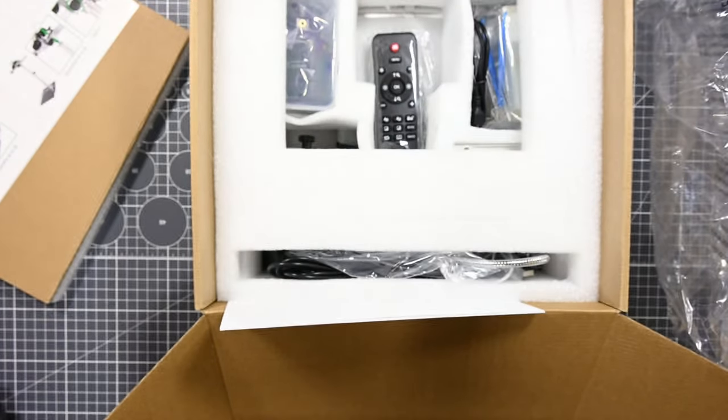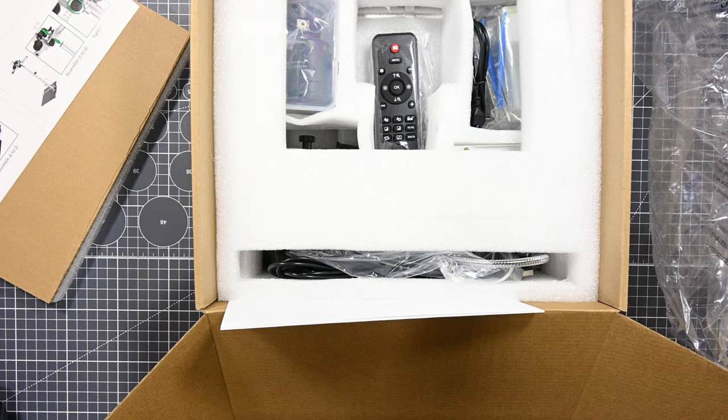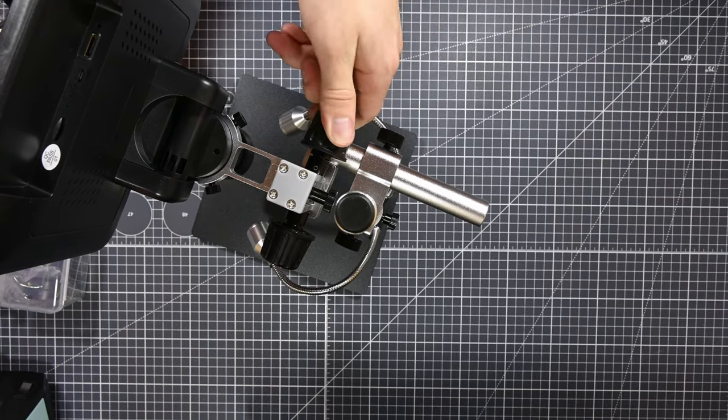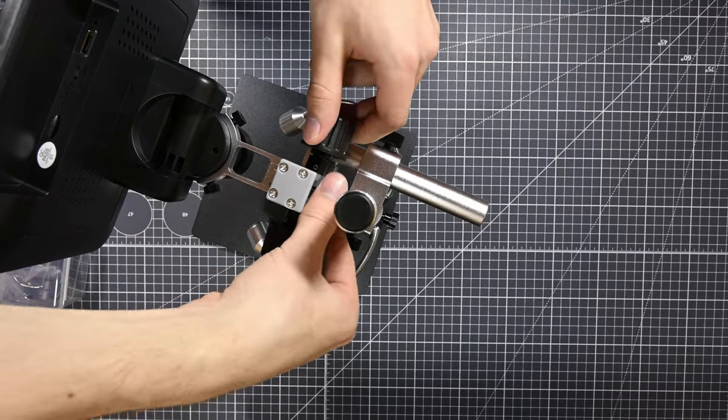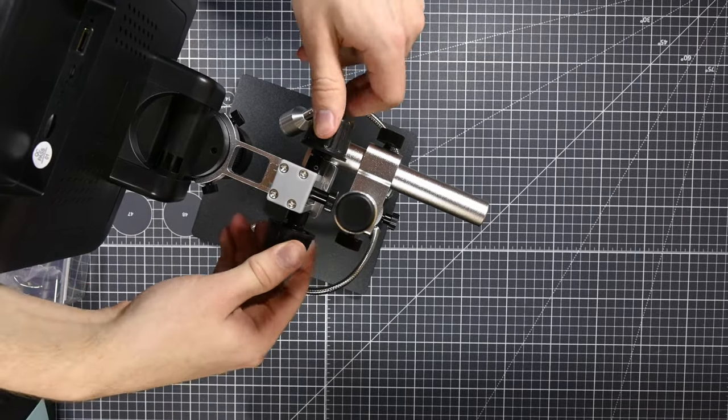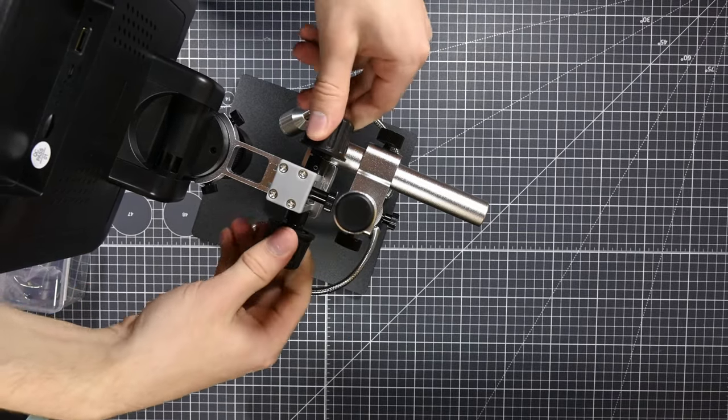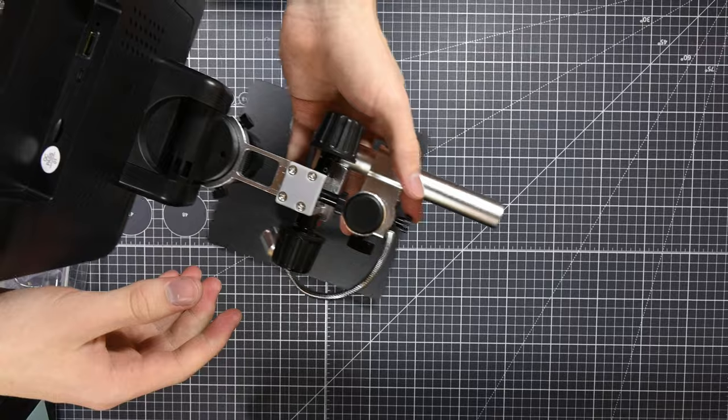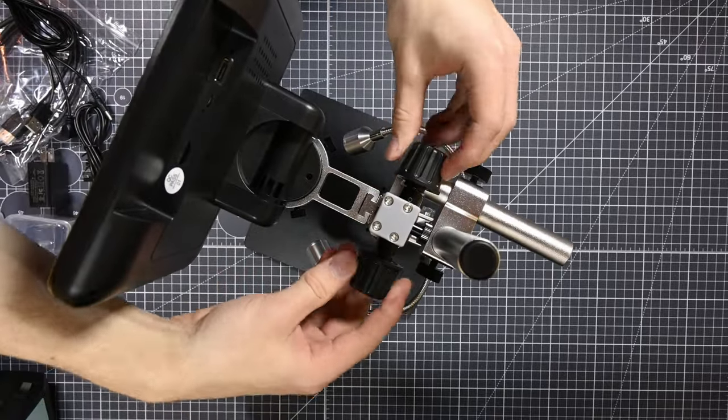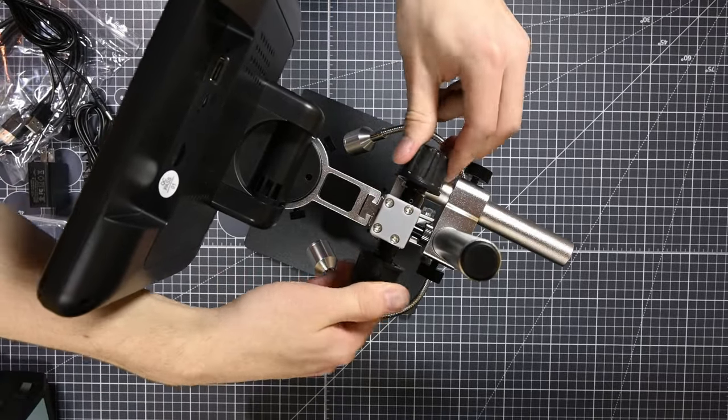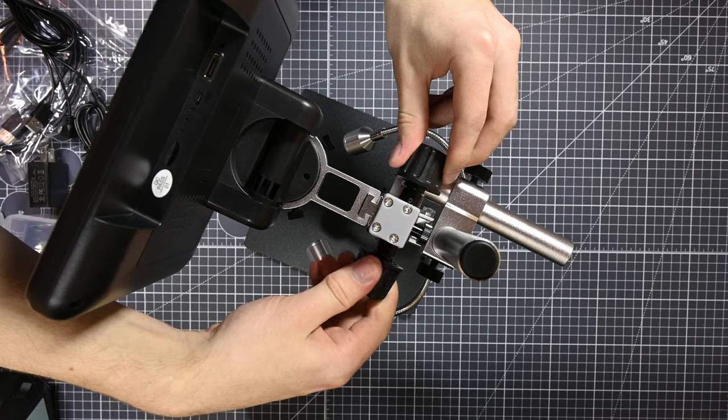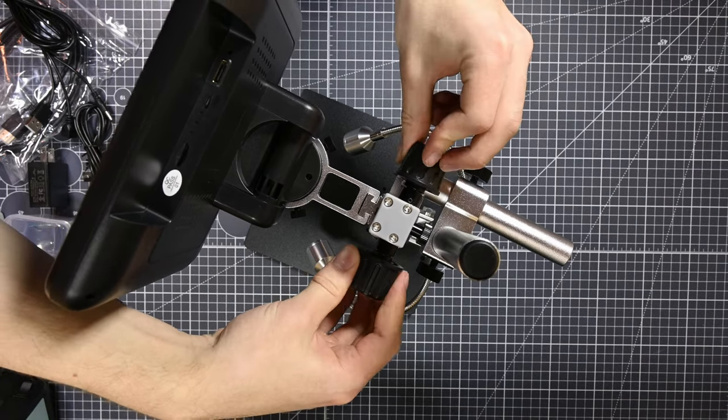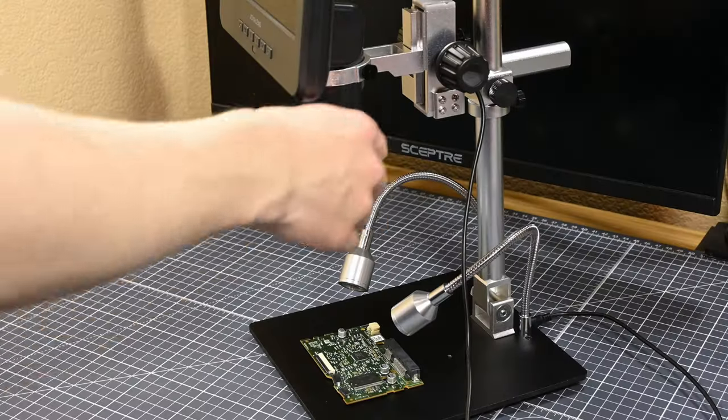That's most of the build quality stuff out of the way. I'll mention some more specific build quality aspects as I go about using the microscope throughout the rest of the video, but the overall verdict is that it's not the most robust feeling thing I've ever felt, but for $150, with the image quality it offers, I think that it's more than acceptable as long as you take care of your stuff.